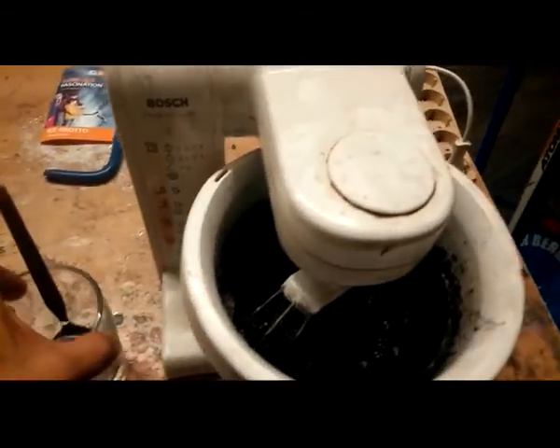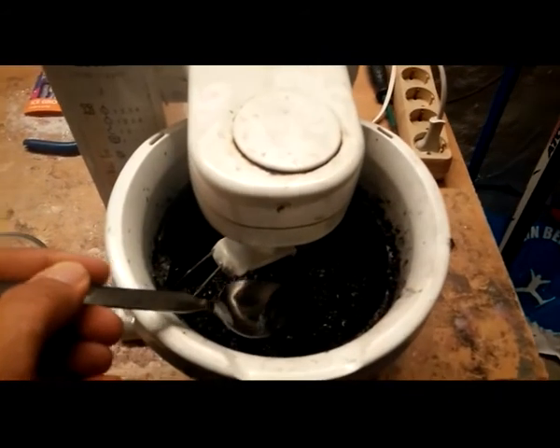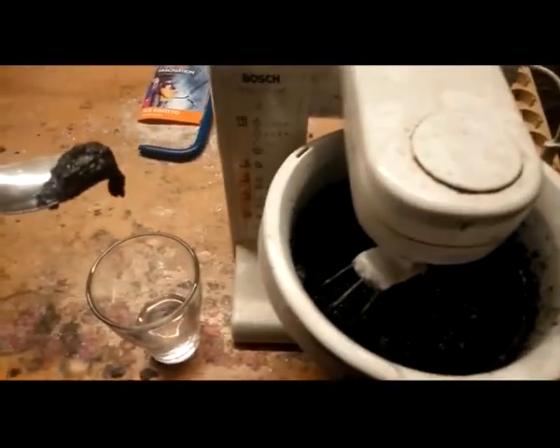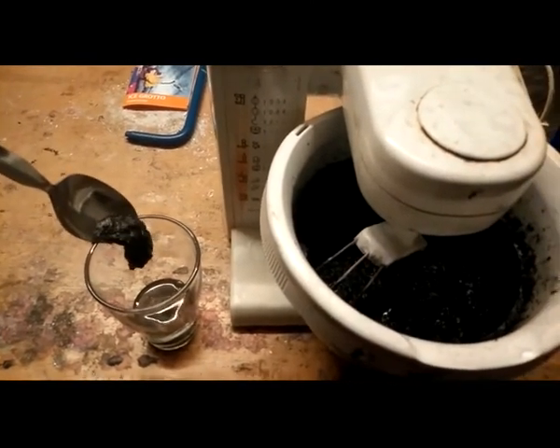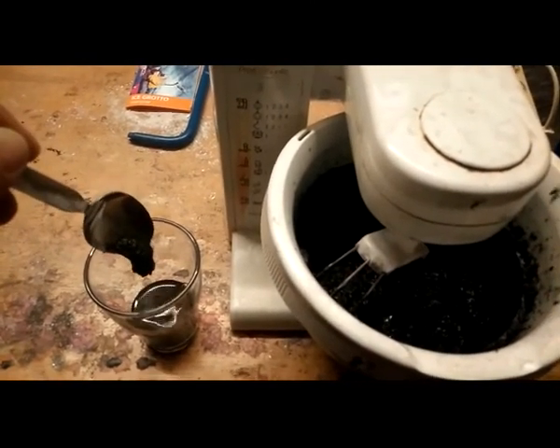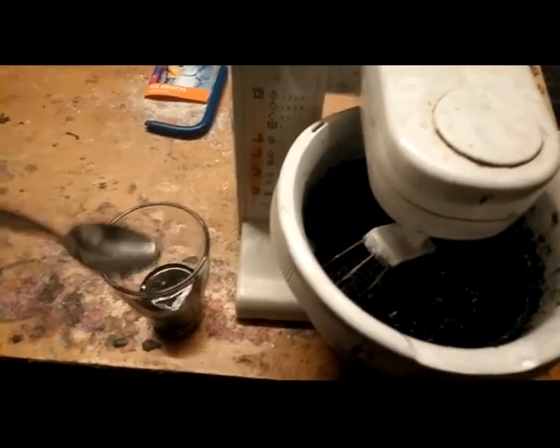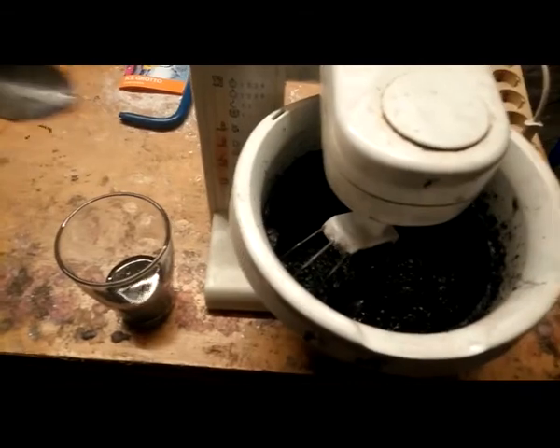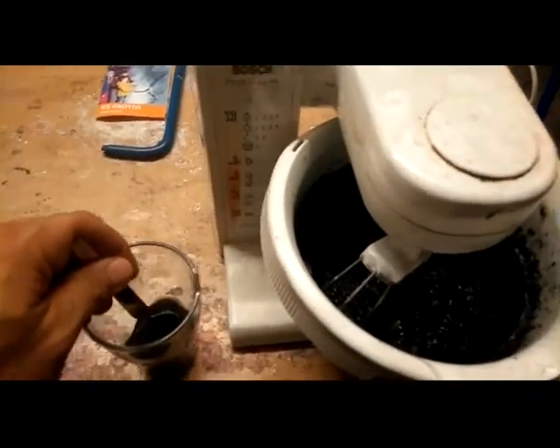After some hours of mixing, I get this mix of sugar and graphite. I think I have to heat it a little bit more, then it's getting more sticky and it makes better graphene, hopefully.